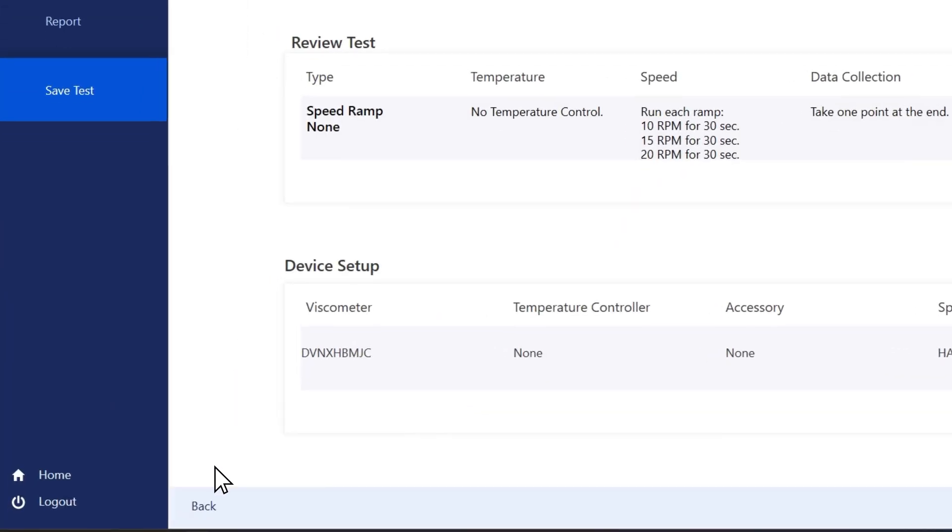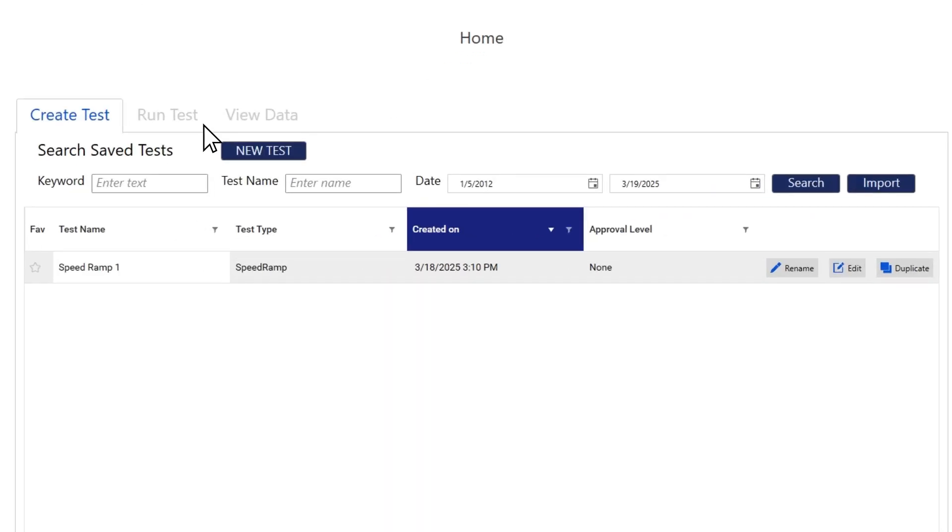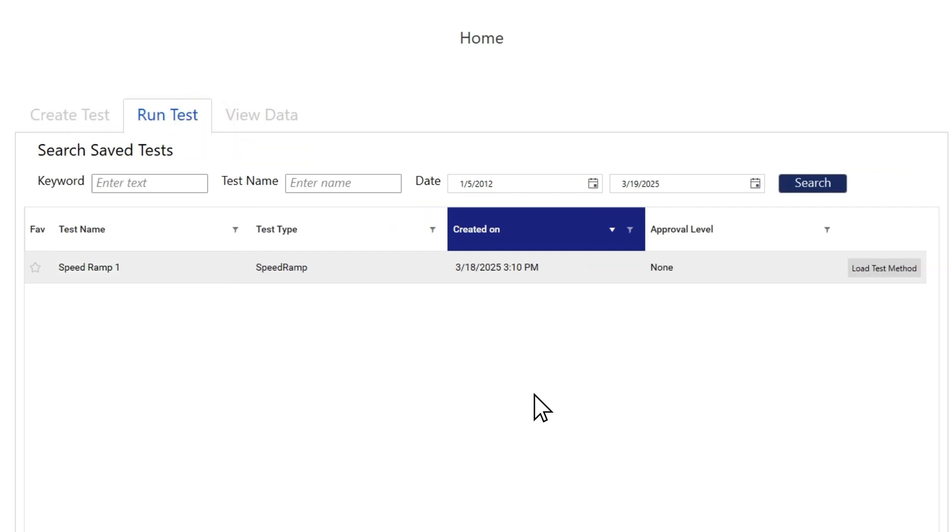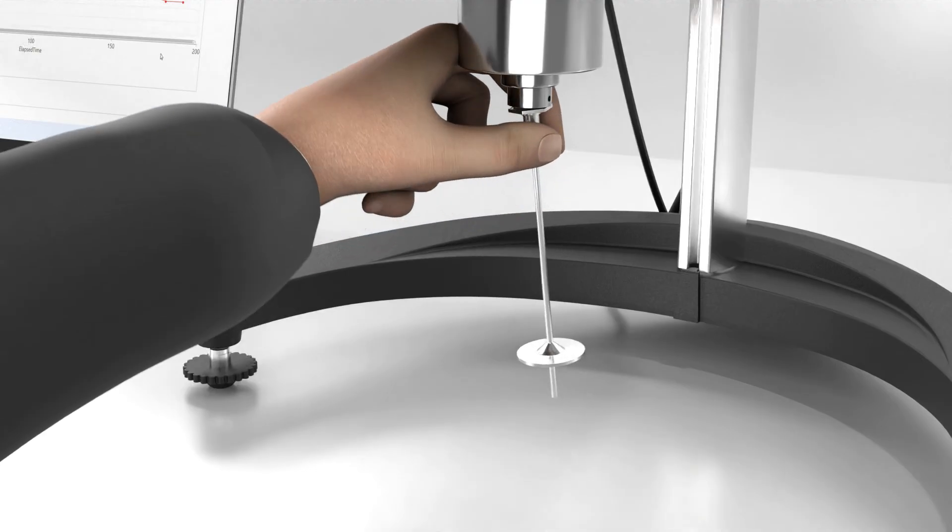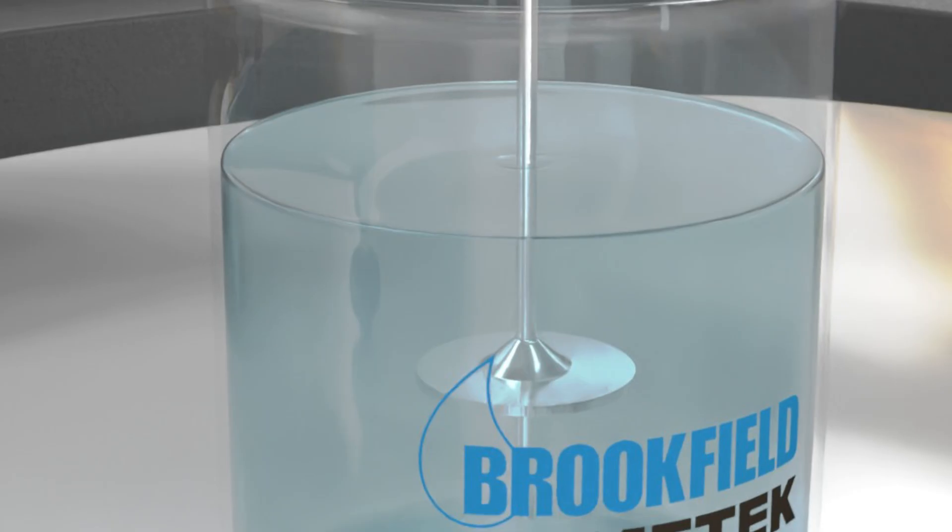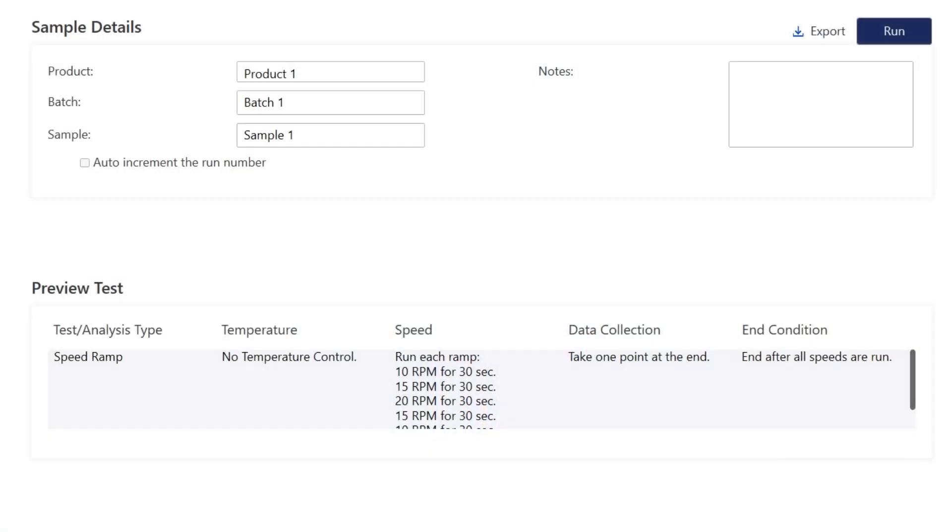Go to the home screen and select run test. Load the test we just created. You can see the sample details and preview tests. Before we press run, attach the spindle and lower it to the immersion mark. Press run to start the test.